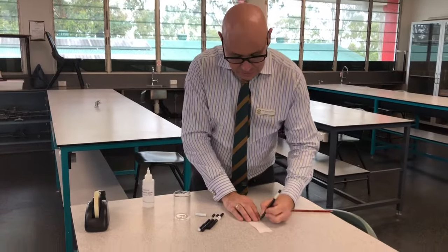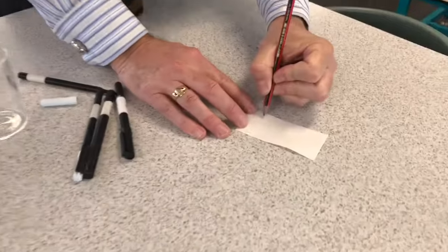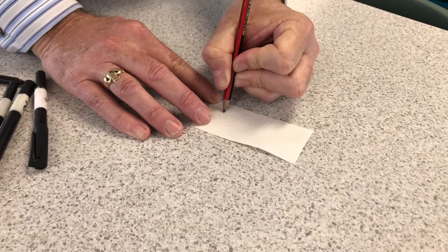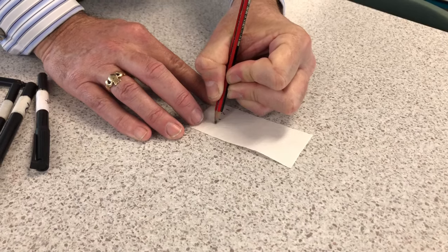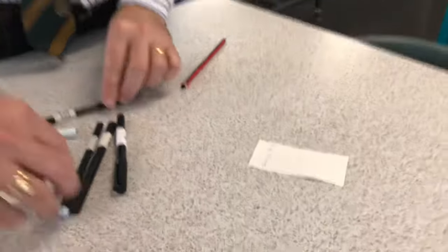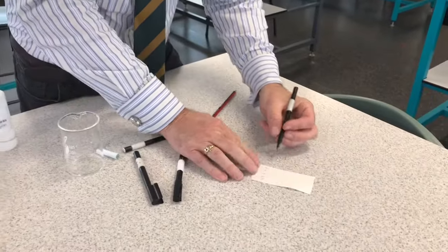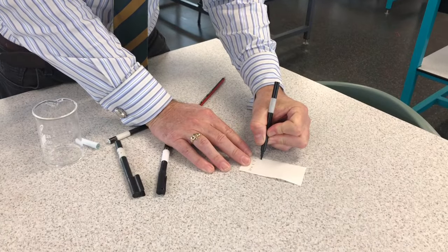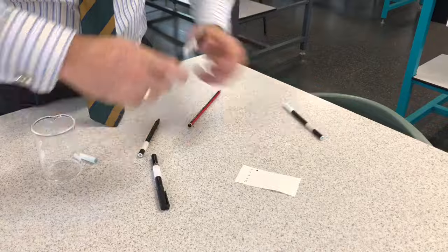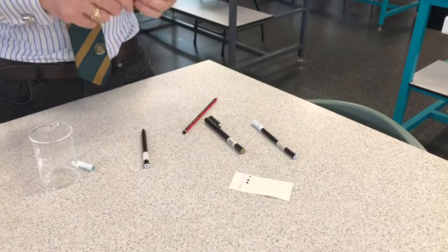I'll use my pencil first to make some marks - one, two, three, four, and then CS for the crime scene. We've labeled our pens so we know which one's which: pen one, pen two, pen three, pen four.